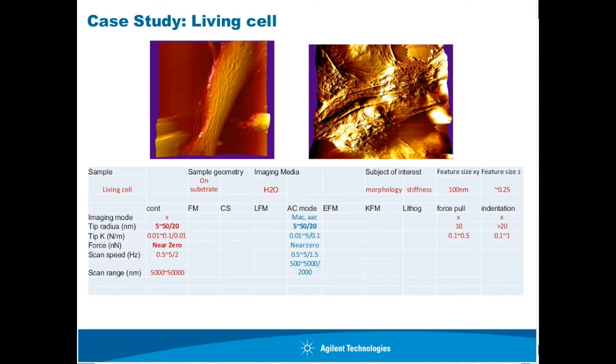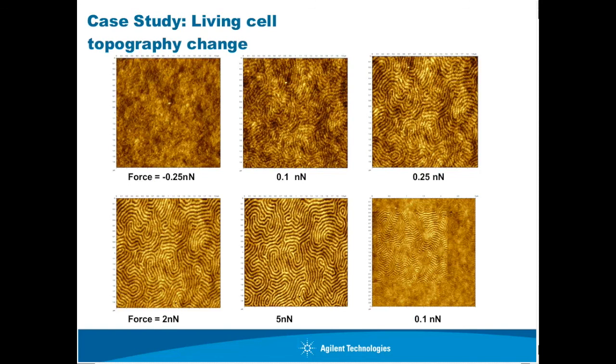Next question, and you may need to read this yourself, Song, but I'll give it an attempt. Hi, Song. In slide 34, you showed images with different forces, and it showed the best image at 5 nN. What is this force actually? Is it a set point value? Where do we apply this force?